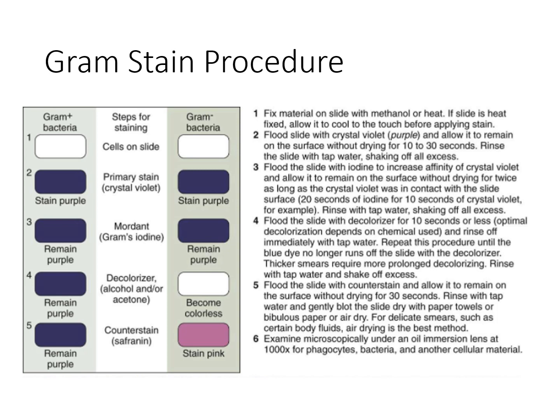But once it has set, then you will rinse that off with water, and then you will flood the slide again with the iodine, and this allows that crystal violet iodine complex to take place. And then after you've let that sit for the allotted amount of time, then you will rinse it off. And then from there you will use the decolorizer.